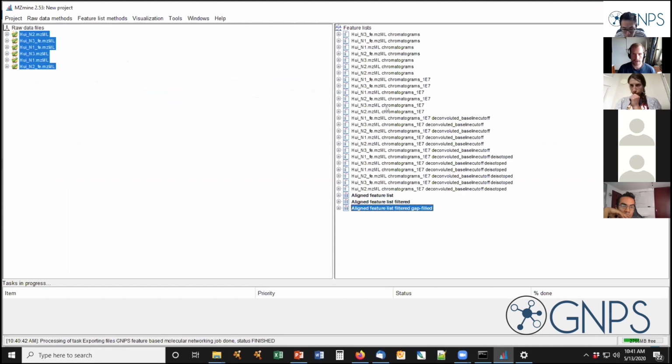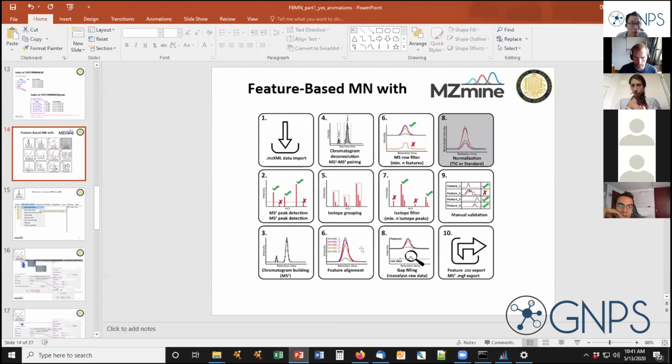All right. So shall we go quickly back and iterate the gap filling for a second and then go to the breakout rooms? Yeah, I think that might be helpful to go through gap filling again. Okay, so that was basically just the last step. If you look at our recipe here, maybe we can just go through gap filling and the export one more time to the end. Sorry, I think that would be helpful.